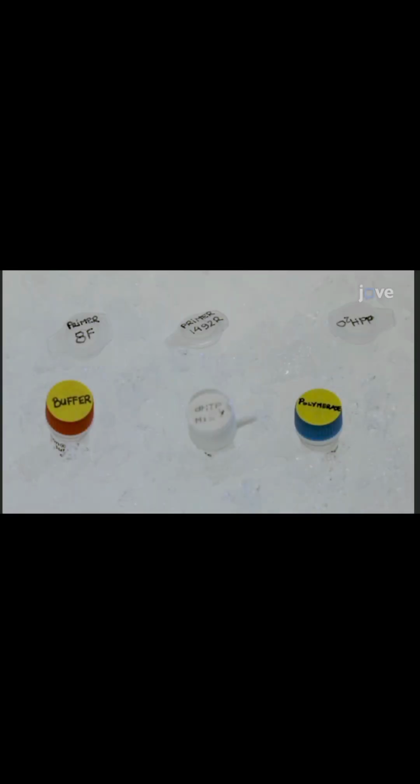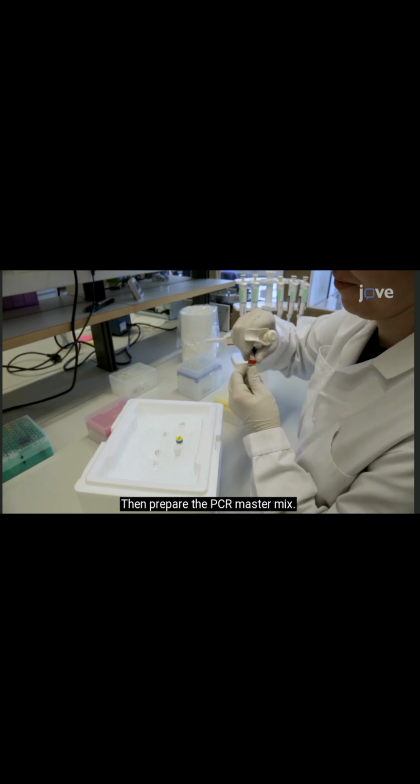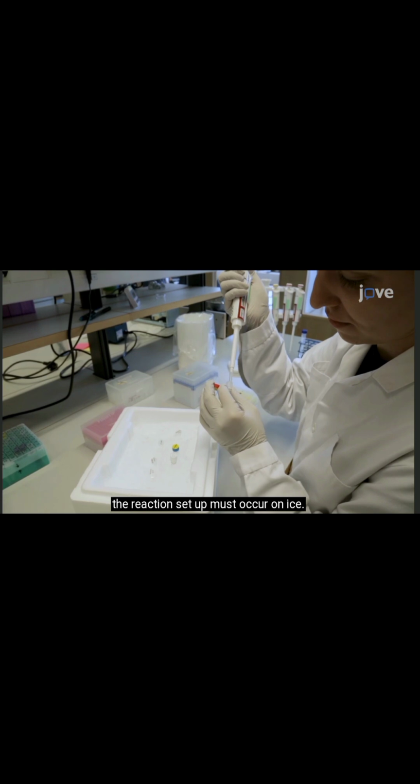To begin the PCR protocol, thaw the necessary reagents on ice. Then prepare the PCR master mix. Since the DNA polymerase is active at room temperature, the reaction setup must occur on ice.